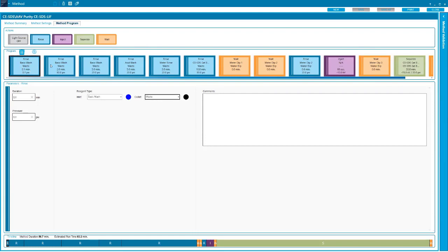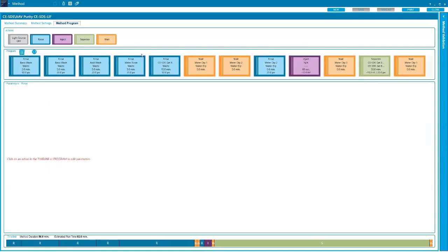And what's unique for our AAV purity methods is we really utilize what we call field amplified sample stacking. So here we're introducing a water plug prior to our sample injection, really to create a difference in ionic strength between that water plug and our gel buffer. And what that helps to do is it gets a lot more sample introduced with our electrokinetic injection. And the sample is going to stack at that interface between the water plug and the gel buffer. And thus you get that field amplified sample stacking acronym, FASS.